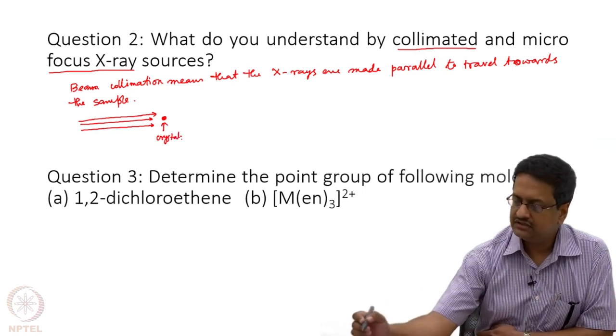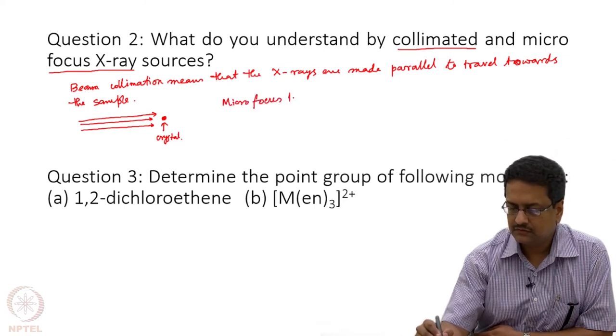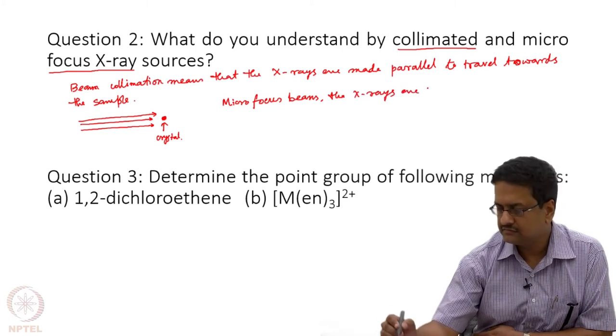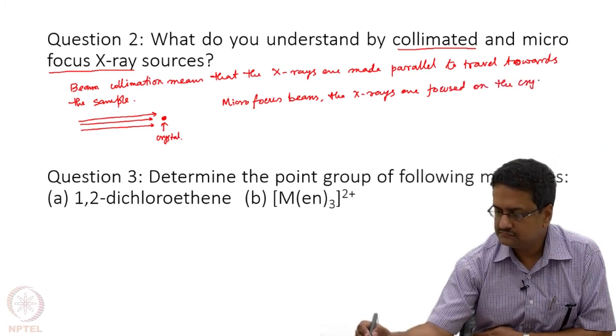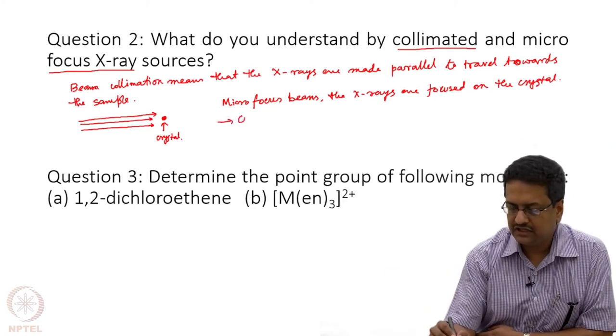But then, when we say microfocused, in case of microfocus, the X-rays are focused on the crystal. That is, it becomes a convergent beam.